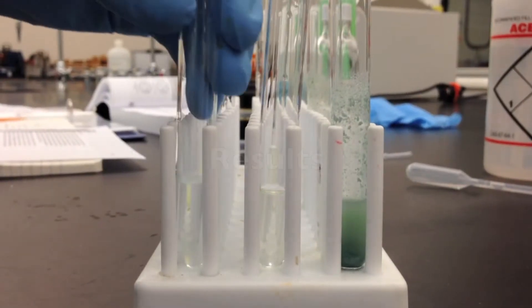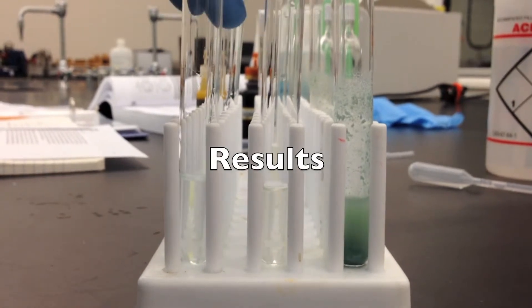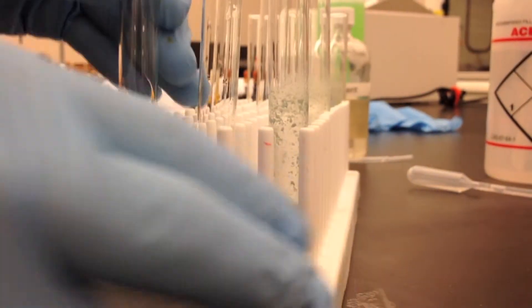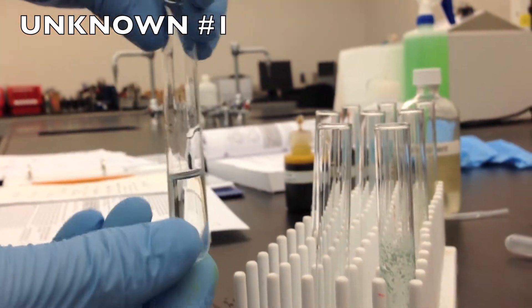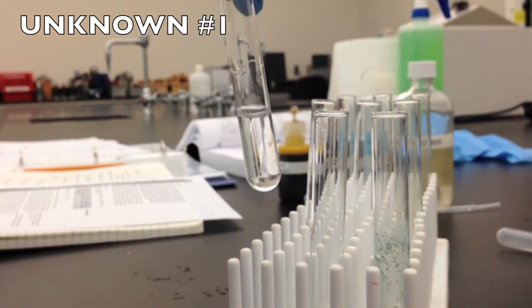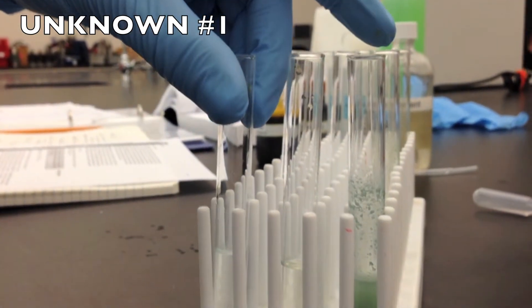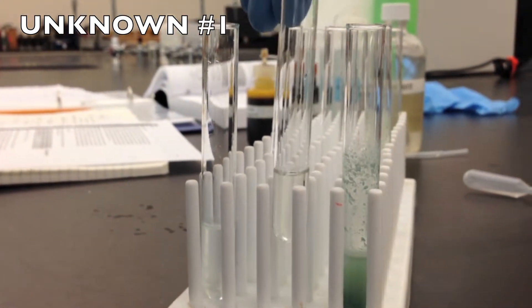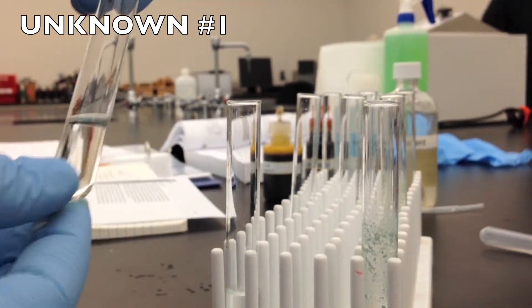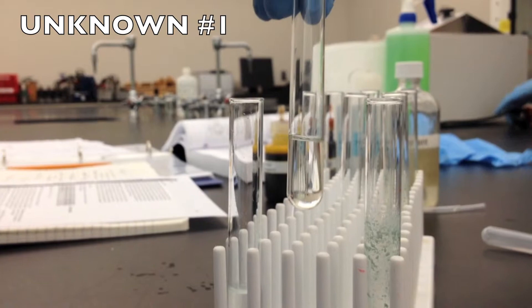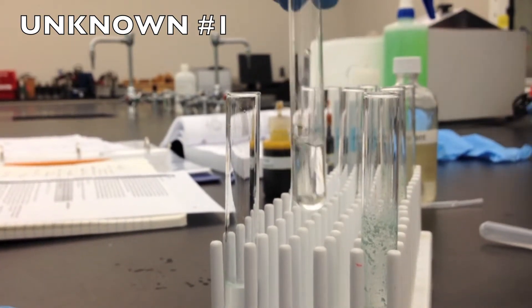Okay, now we'll go over the reactions of all three tests for all three unknowns. The first unknown for the iodoform test, we got a negative result. So we can assume that that is not a secondary alcohol. We also got a negative result for the Lucas test. So we can assume that it is not a secondary or tertiary alcohol.